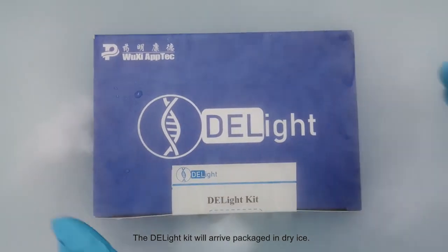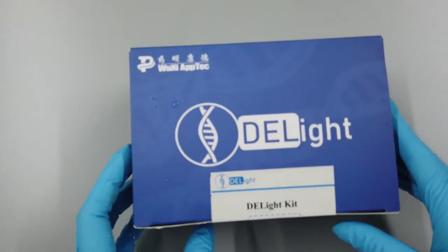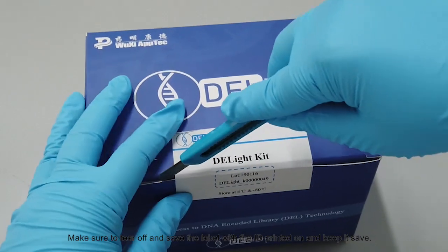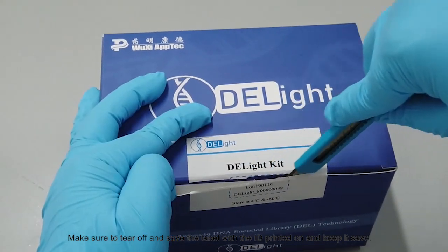The DELight kit will arrive packaged in dry ice. Make sure to tear off and save the label with the ID printed on it and keep it safe.